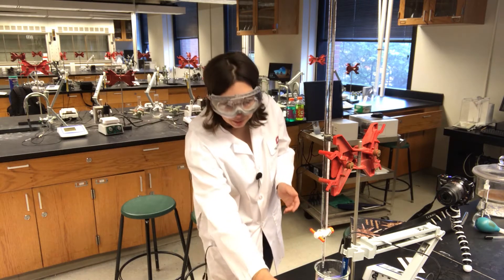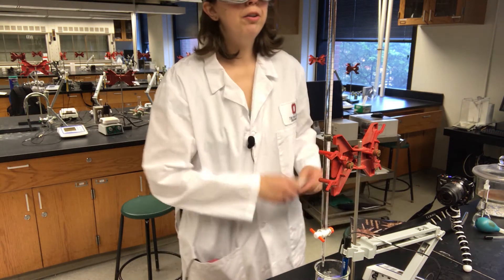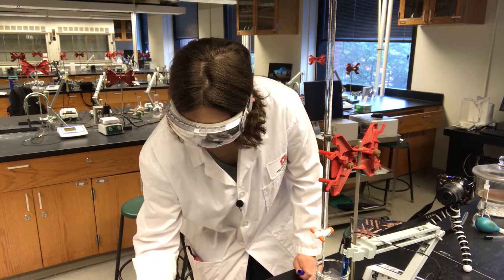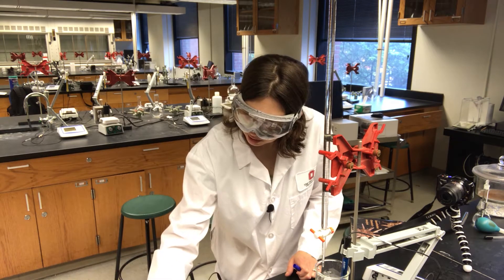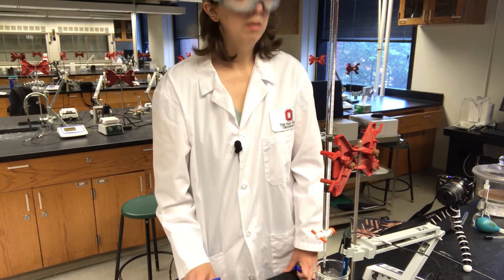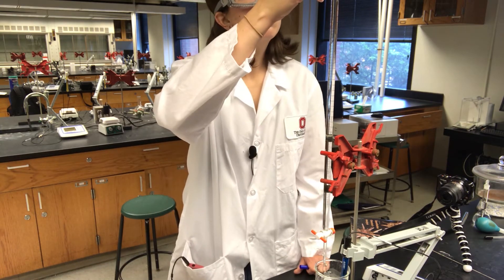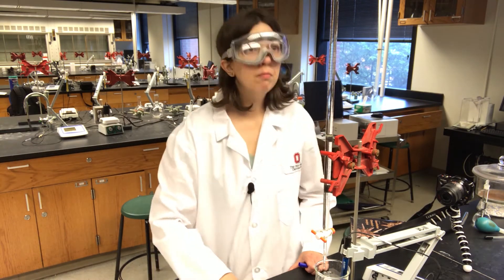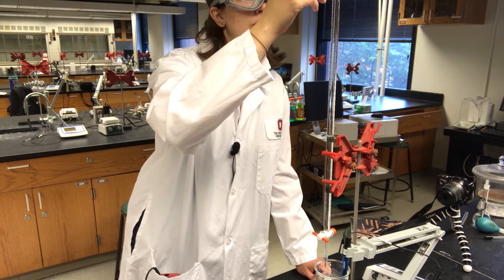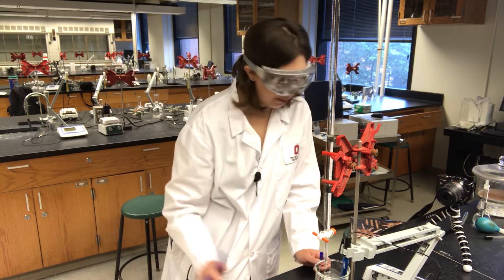Now we want to be careful that the stir bar isn't hitting the pH electrode, so you've got to set that up just so. We don't want to stir too fast — that's a little much. At a burette reading of around 7.58 mL, I'm getting a pH of about 2.40, and at the next reading the pH is 2.62.